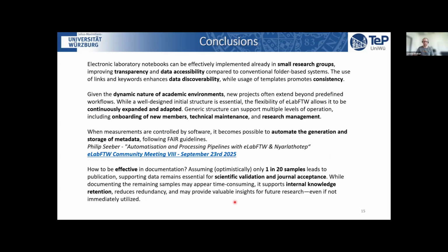Sometimes it's actually more important the way you get to this 20th sample, because if you want to reproduce it, you want to see what you grew before, what you produced before, what was your calculation before you reached your goal. And this also can be very helpful. And if you don't protocol it, then this data is lost and it's harder to reproduce your result. Thank you for your attention.